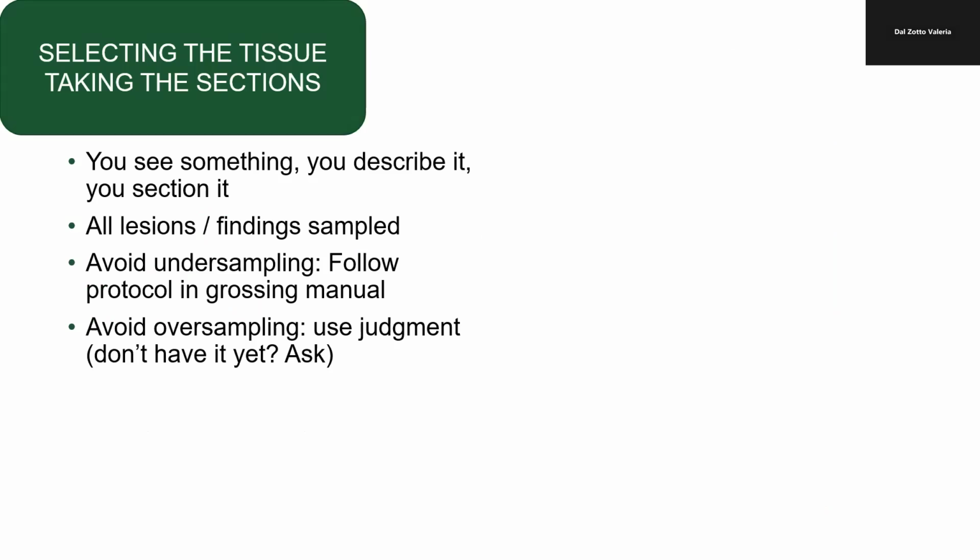Selecting the tissue and taking the sections. As a general rule, if you describe something that you see, you take a representative section of it. All lesions or findings should be sampled. Avoid undersampling and avoid oversampling.